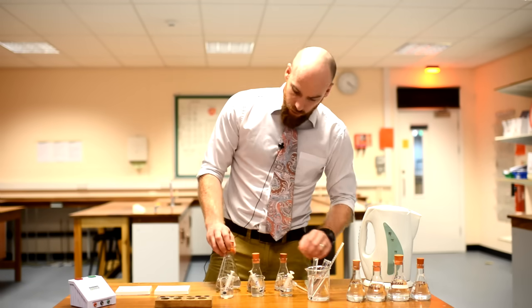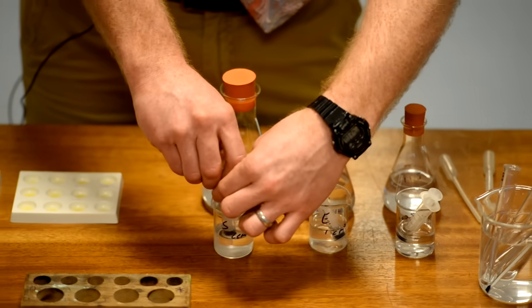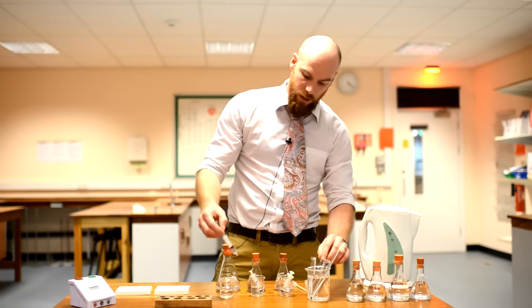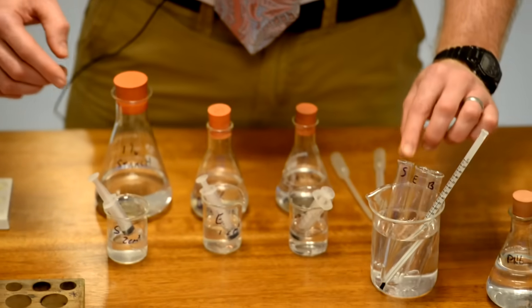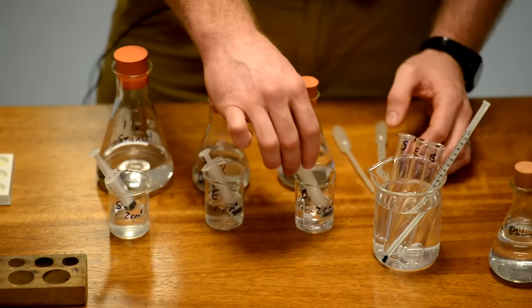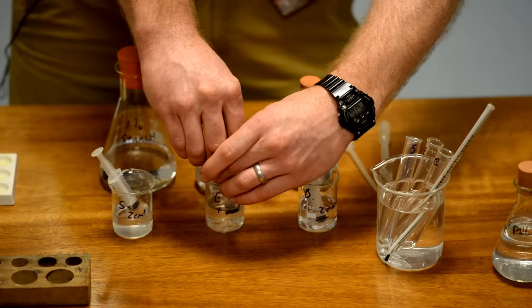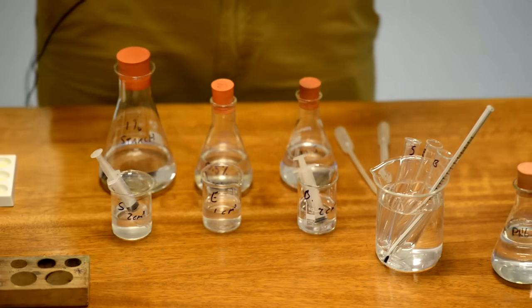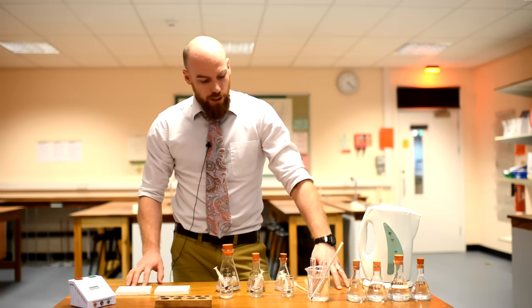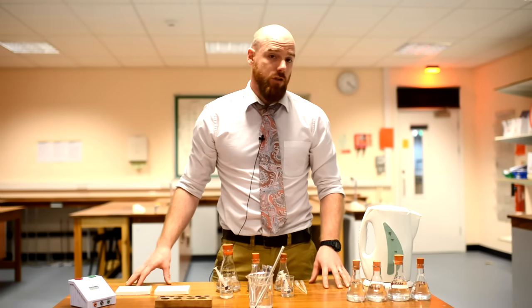So to do this practical I took two centimetres cubed of starch solution using my syringe here and I transferred that into the test tube labelled S for starch. I did the same for the buffer solution, two centimetres cubed, and now I'm just going to do one centimetre cubed for the enzyme. Centimetres cubed is the same as millilitres. It's a good idea to get those solutions into your three tubes early on and allow the temperatures to adjust.